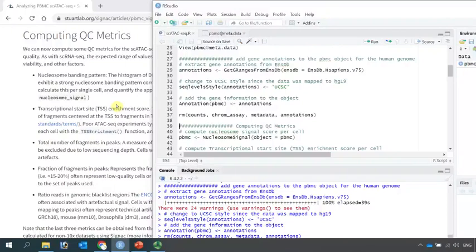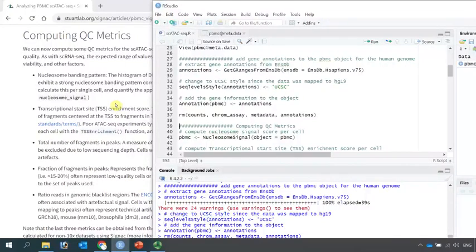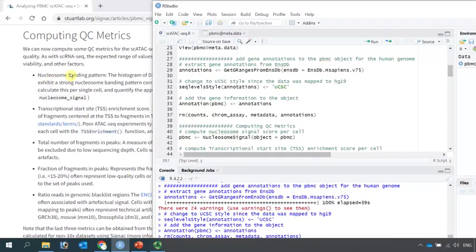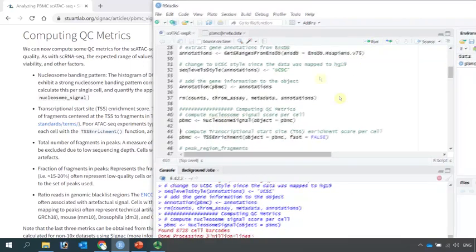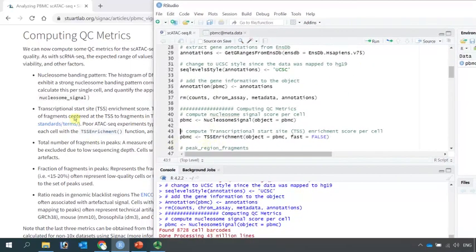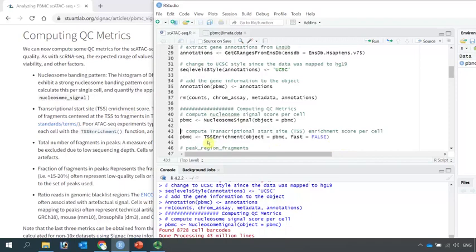If you have looked at the online tutorial, currently the tutorial uses five metrics to assess the data quality. The first one is the nucleosome banding pattern. Then we can compute the nucleosome signal score per cell. The second one is the transcription start site enrichment score. This metrics data could be calculated by the TSS enrichment function.